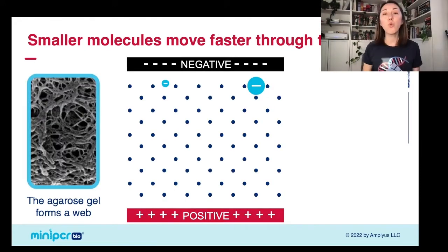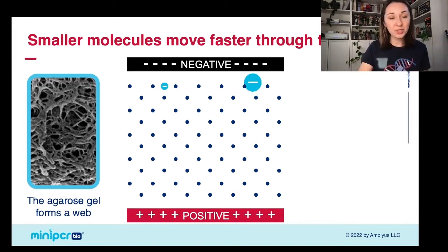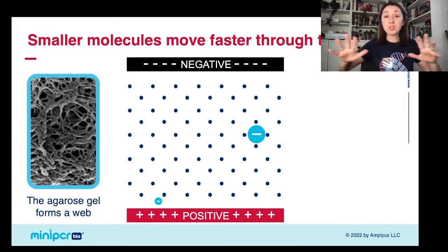So you have one force that is pulling the molecules. That is going to be that electric charge. It's going to be pulling them towards one side or the other. But remember, you also have that web of agarose in your gel, and that's going to be slowing them down. So small molecules are going to be less resisted by the presence of that agarose. And big molecules, based on their size and their shape, are going to be more resisted by that agarose.